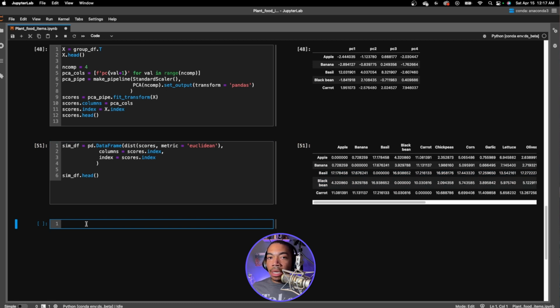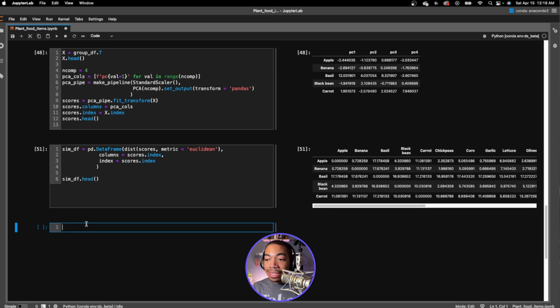And let's begin our actual recommender. To do this, we're going to create a couple plots that we can visualize as we are making recommendations, and then see the similarity in the context of the entire suite of plant foods. The first plot I want to make is a scatter plot of the PCA data, because that is the source data for the similarity matrix. So to do that, let's use subplots. So fig, here we're going to set ncols equal to 2. These would be side by side.